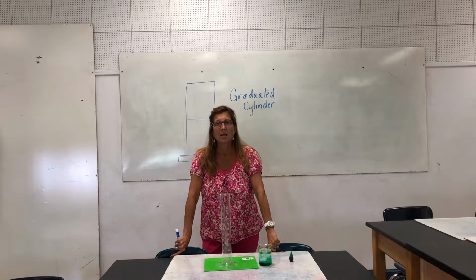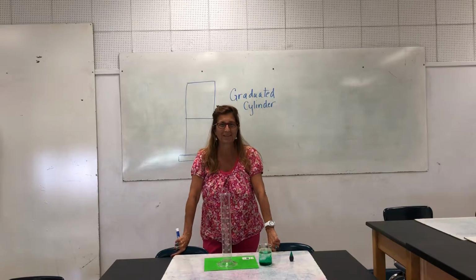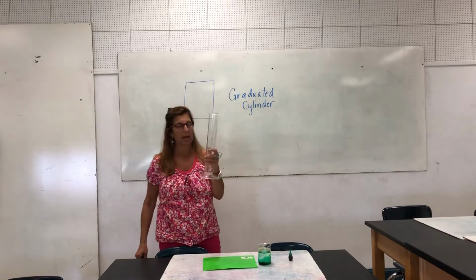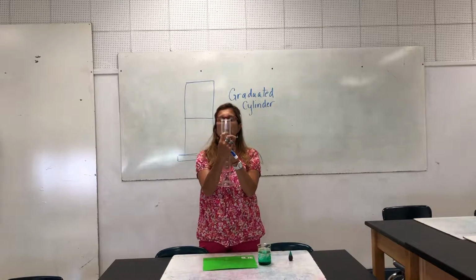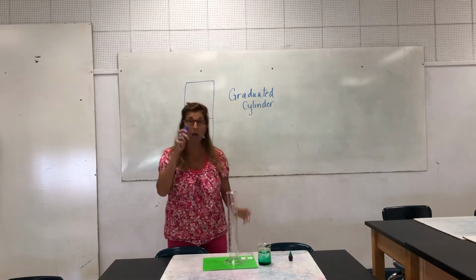Hi everybody. Another equipment instructional piece. We're going to learn how to properly read a graduated cylinder today. And for that purpose I have a 500 milliliter. You can tell by the number at the top. It's right here. It tells you the total volume, and let me say that again, volume.